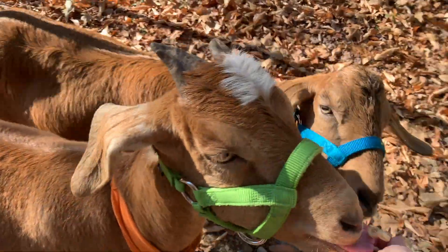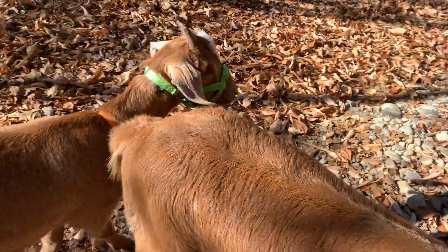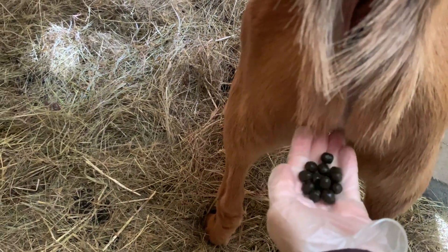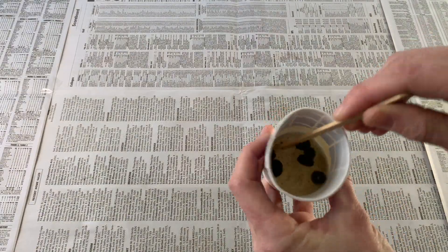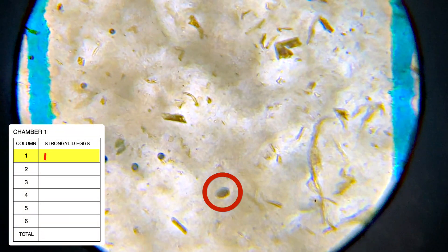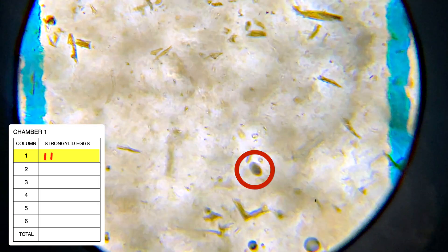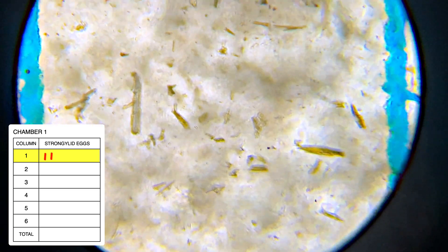In this video, I'll show how to do at-home fecal egg counts for goats and sheep. A fecal egg count involves taking a sample of your animal's poop, mushing it up in a saltwater solution, and then looking at it under a microscope to count how many parasite eggs are in the sample. This count gives you a rough idea of your animal's overall parasite load so you can treat accordingly.